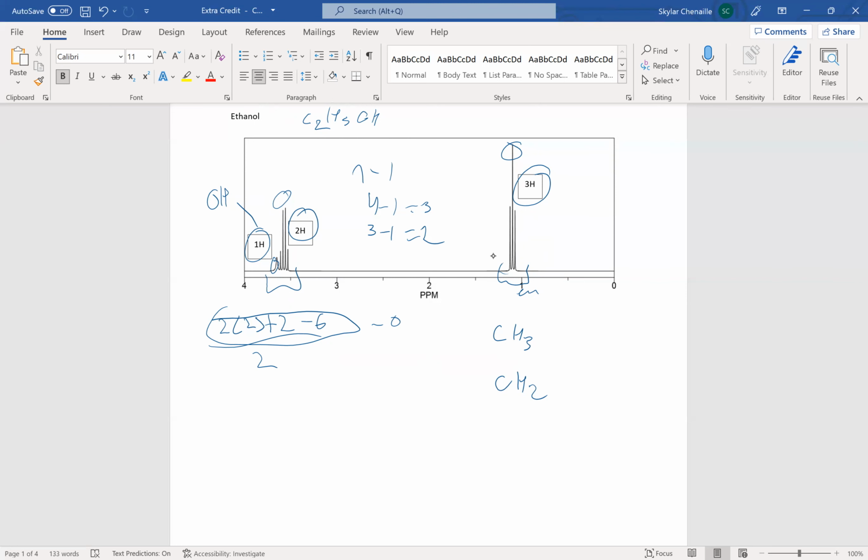If we're assuming that our OH group is indeed that 1H, that means we would have something where it's OH. So we'll have our OH group attached to the carbon that's neighboring the one with 3.